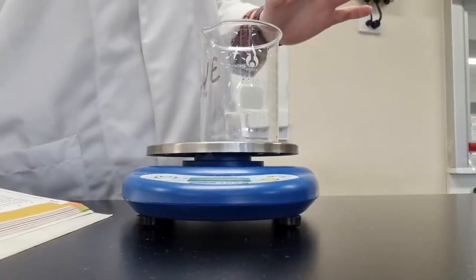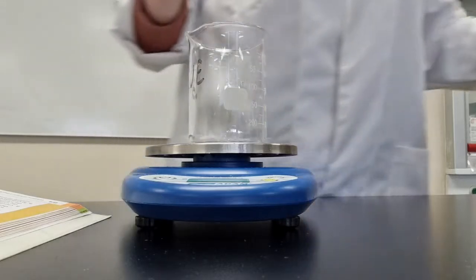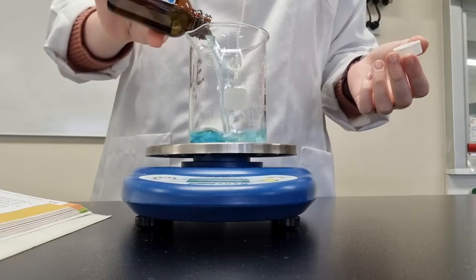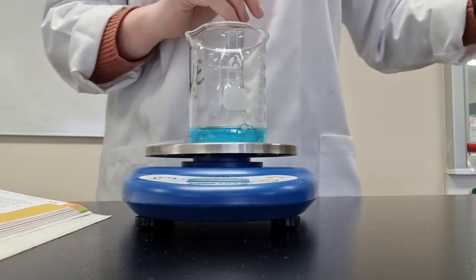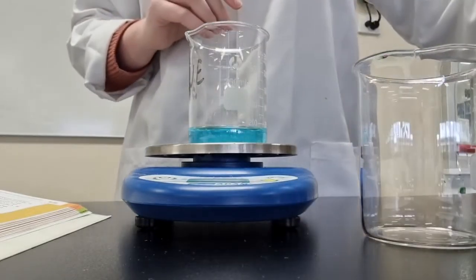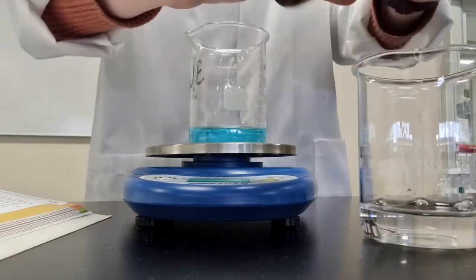Now I'm going to put that one to the side, and again I'm going to fill up this beaker again with more copper sulfate. What are the chances that I can open this one? I can actually do it. Amazing. So more copper sulfate. And this is my last clean beaker, and I'm going to put ammonia into this one. Another 50 mils of that.